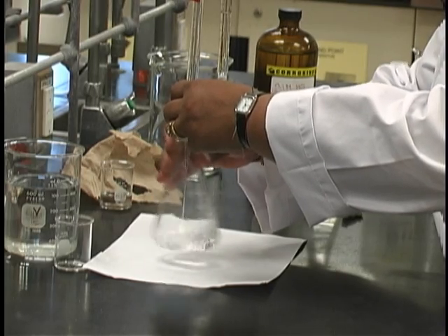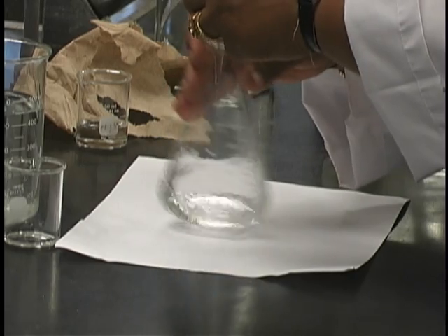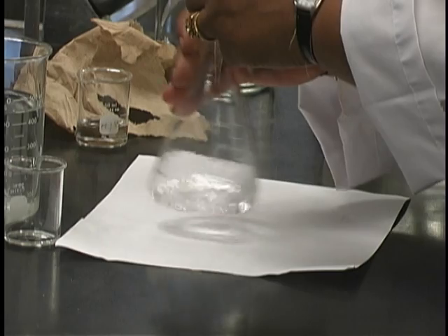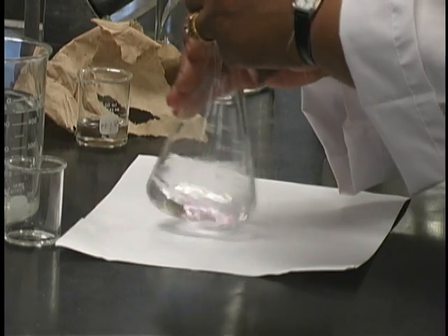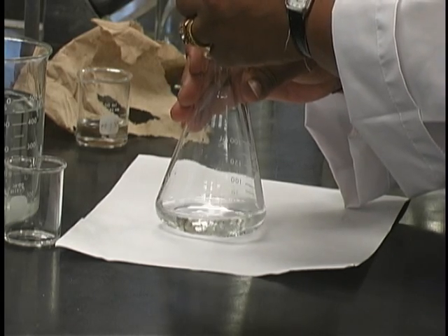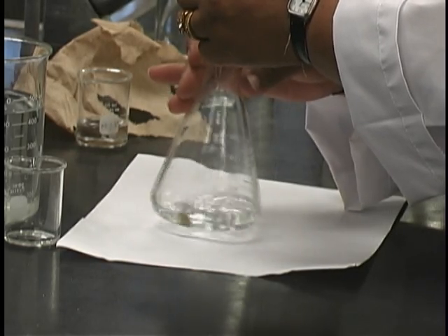When you start to see the first signs of pink, you should very much slow down the addition of the base. Then commence drop-wise addition; the drops can be rapid at the beginning and can slow as you get closer to the end point. Note that the right hand should be constantly swirling while the left hand never leaves the tap. The pink color has disappeared, but this tells us that we are close to the end point, and so now the drip rate should be significantly slowed.